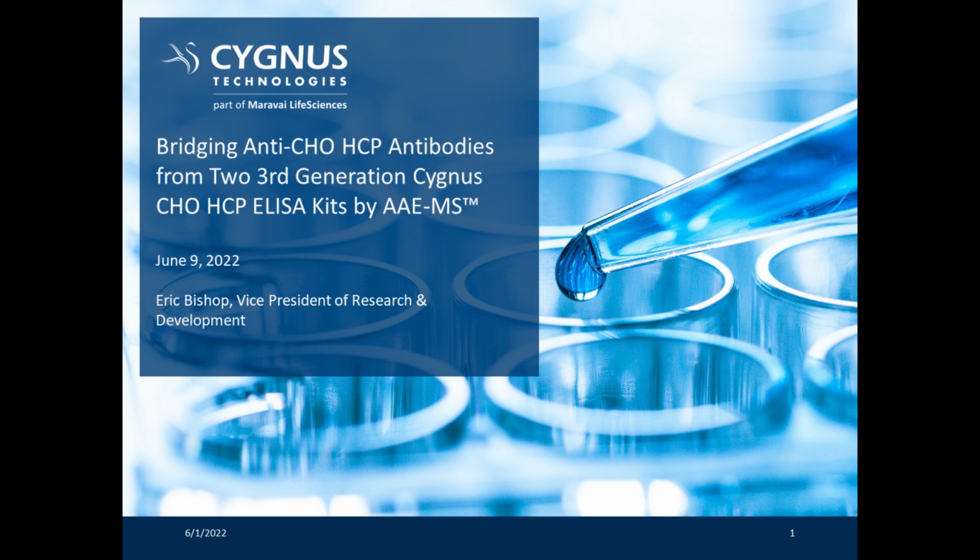Welcome, and thank you all for taking the time out of your day to participate in this webinar. Today we're going to discuss a case study for bridging of the F550 to the F550-1 CHO host cell protein ELISA at Cygnus Technologies. Hopefully, this can be used as an example of general expectations as well as best practices for a successful transition between two assays.